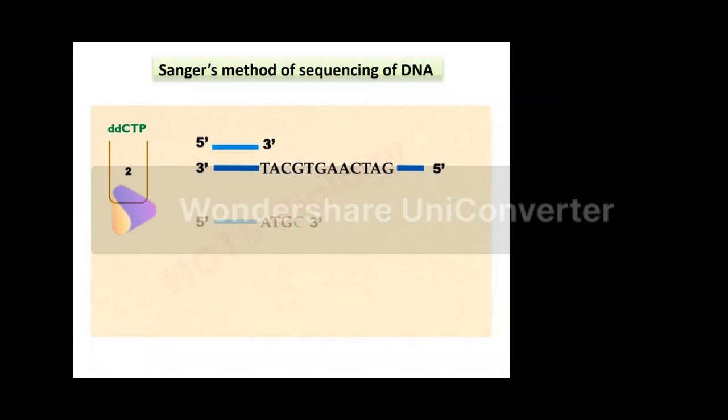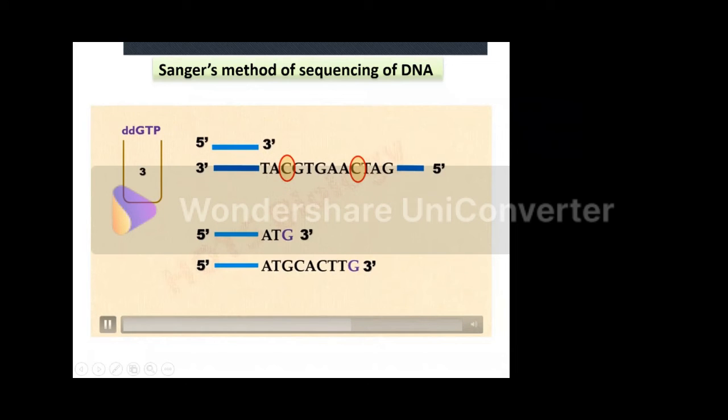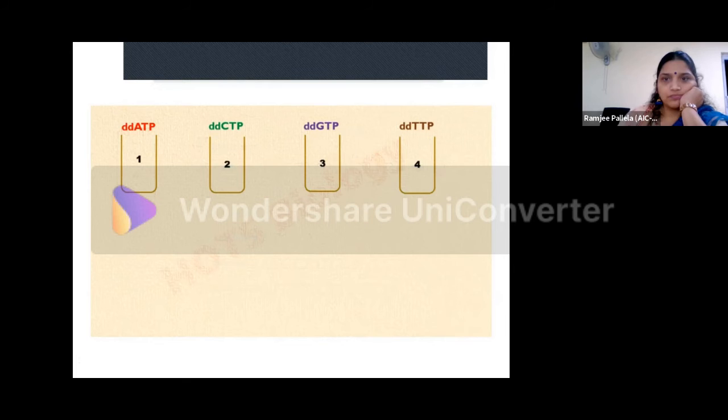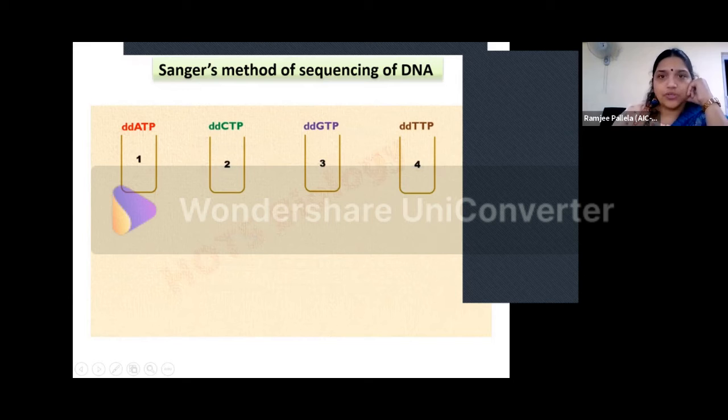Similarly, 3 partial replication products will be produced in the second reaction, where ddCTP will be incorporated occasionally, complementary to guanine residue. In the third reaction, 2 partial replication products are produced. And in the fourth reaction, 4 partial replication products are produced. So I hope you have understood what this Sanger sequencing is all about.